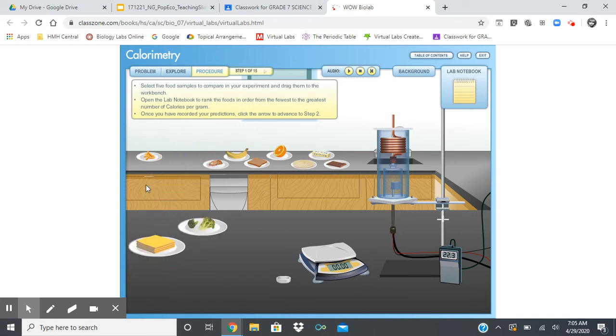Who doesn't like cheese? Carrots and chicken, sure. And bread. I love eating sandwiches. And chocolate, of course. So once you get the 5 there, you want to keep continuing to follow these directions.